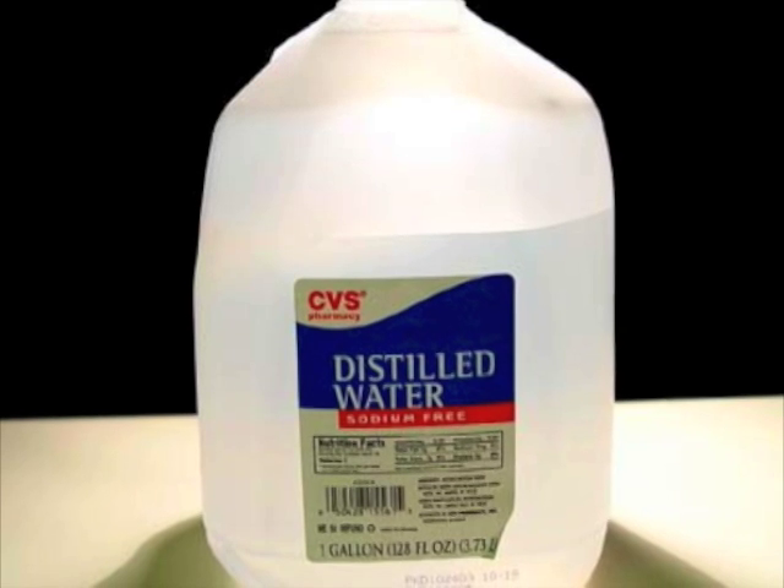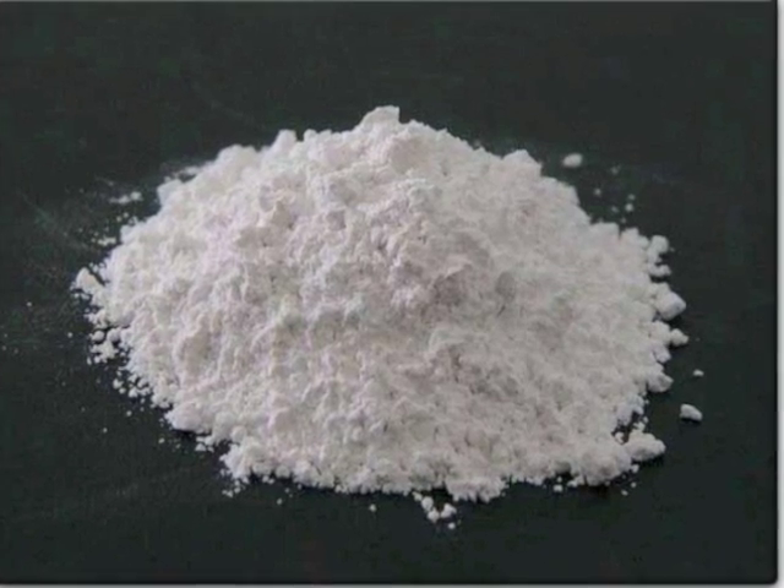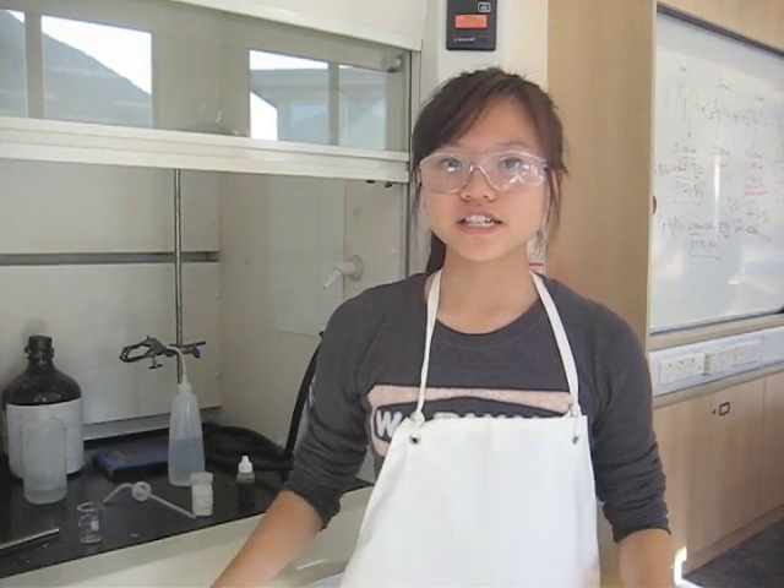The materials you need are distilled water, a rod, universal indicator, sulfur powder, a lighter, a glass beaker, calcium carbonate, and sodium bicarbonate.